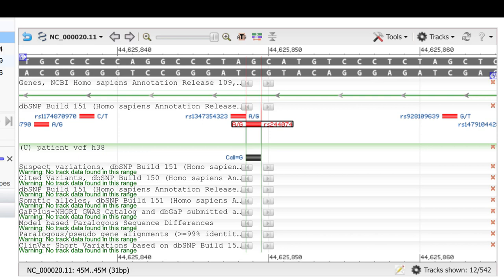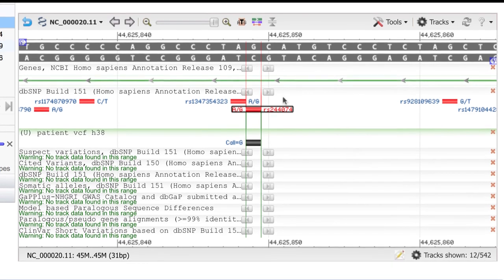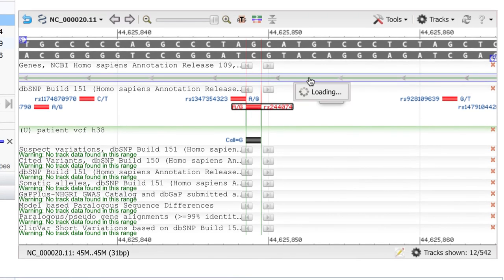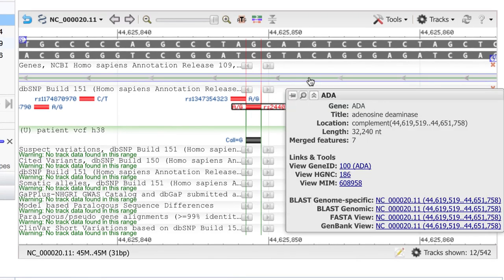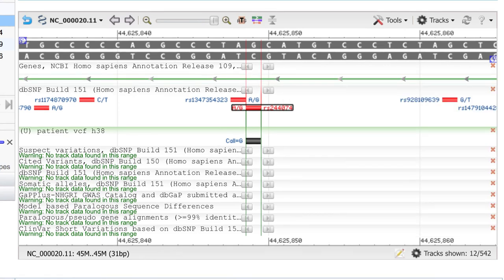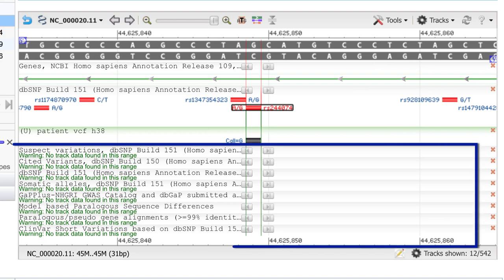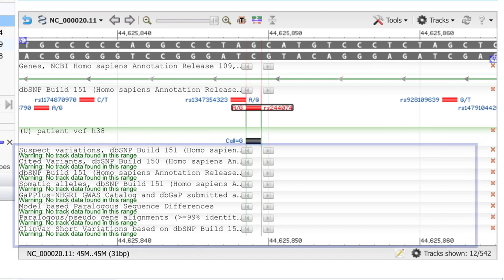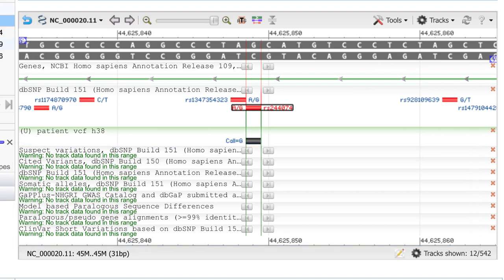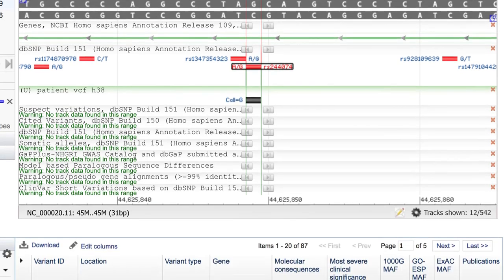Okay, how can we evaluate this G allele? If you mouse over the genes track, you see that we are in the ADA gene. But we don't see any indication of significance in any of these other tracks, such as ClinVar Short Variations or the dbGaP submitted associations.